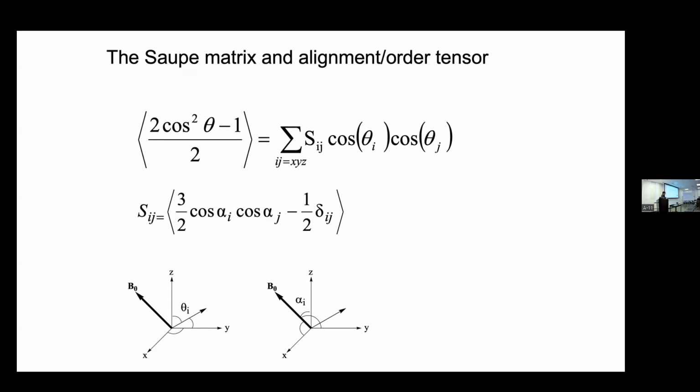What else is not averaging out when I align a sample? We talked about dipole couplings. CSA. So if I partially align an RNA, you will have an incomplete averaging of the CSA interaction. As a consequence, you'll have a small shift on the order of a few 0.01 ppm.